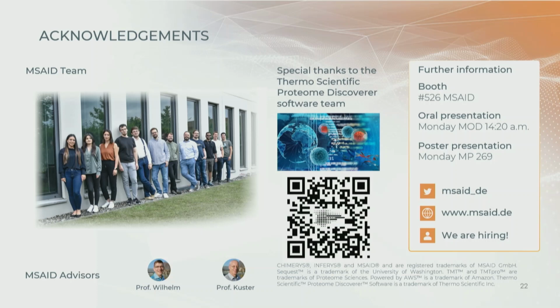So we have compared, and we are outperforming Sequest with precursor detector by a big margin. I think we should really take good care that we don't use experimental intensity multiple times, and we do that here. We predict fragment ion intensities with AI, but the deconvolution is linear algebra.